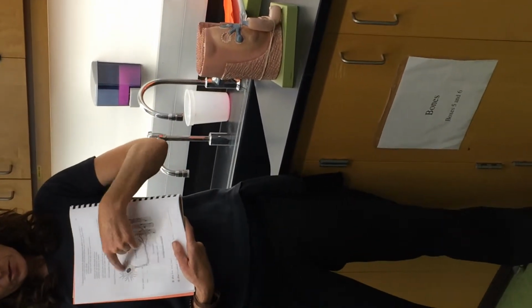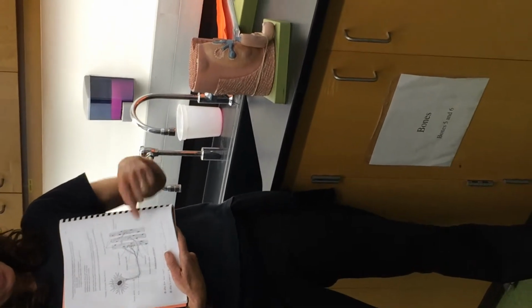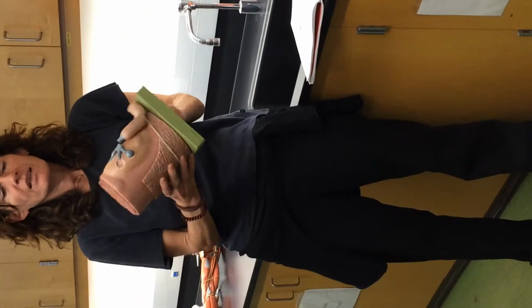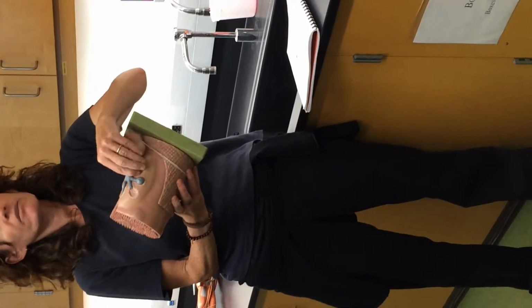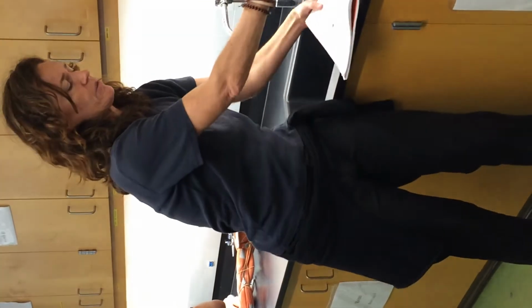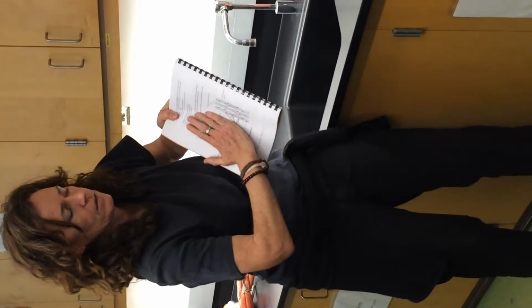So this isn't our structure list yet. All we need to know is, can you see that we can't see the axon, or sorry, all of the neuron on this? If you keep that drawing in mind, can you see that this is like outside somewhere? This is just the end. Would you agree with that statement? Yeah. So a lot of people are like, I can't find the soma. I'm like, it's not there. Don't worry. All you need to know is that this is just a truncated version of this, right?